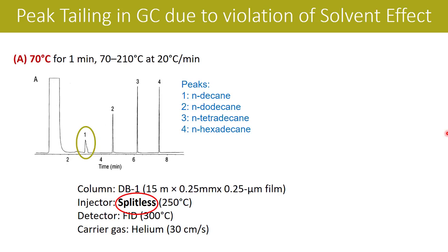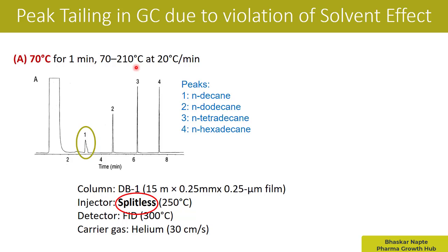Now this is the example we are going to talk about — you will find four different peaks. The column used is DB-1 and the injector mode is splitless, which is very important. The initial column temperature is 70 degrees Celsius for one minute, followed by a ramp of 20 degrees Celsius per minute until it achieves 210 degrees Celsius.